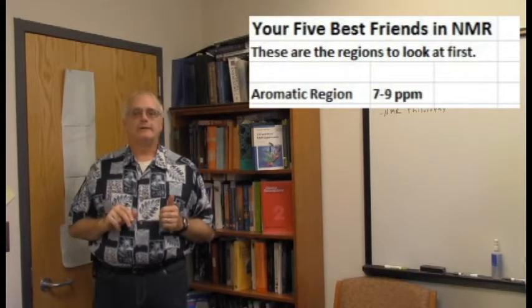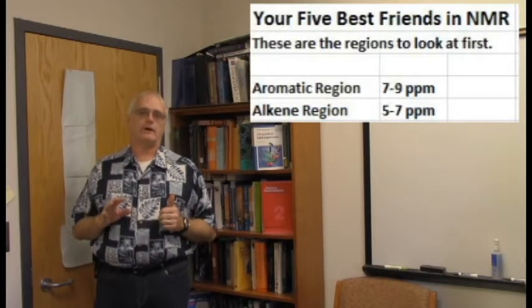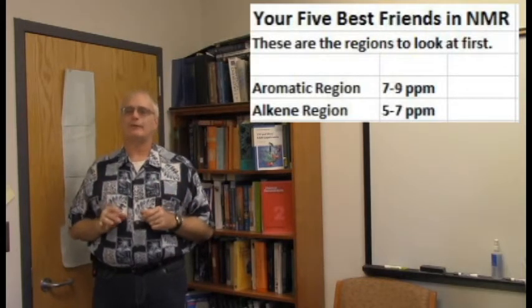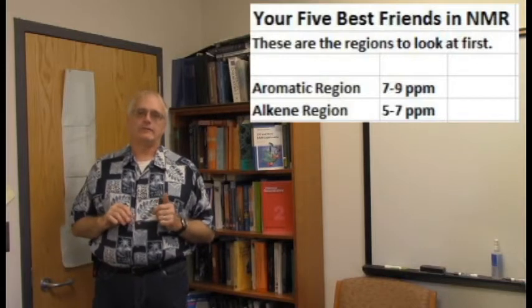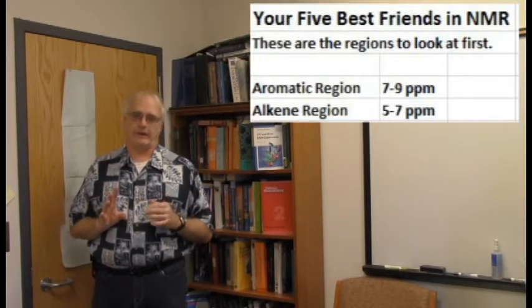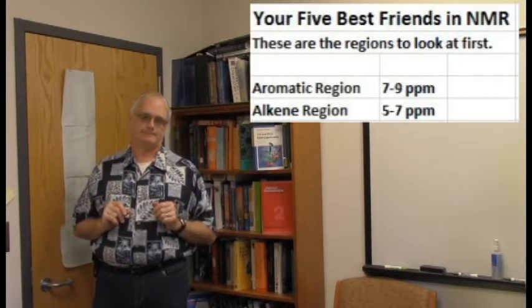Second best friend, the alkene region. This is about 5 to 7 ppm. This is where hydrogens sitting on a double bond are going to show up. Now there can be other things in here, but alkene is by far the most common. And so if you see especially interesting splitting patterns in this area, that is a great characteristic of an alkene.